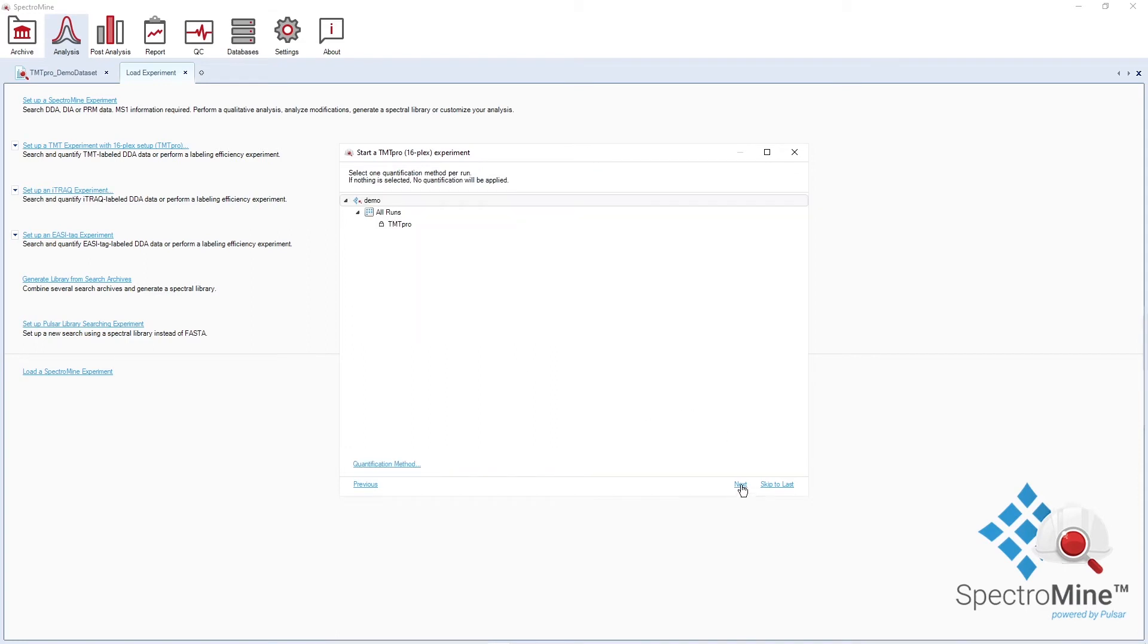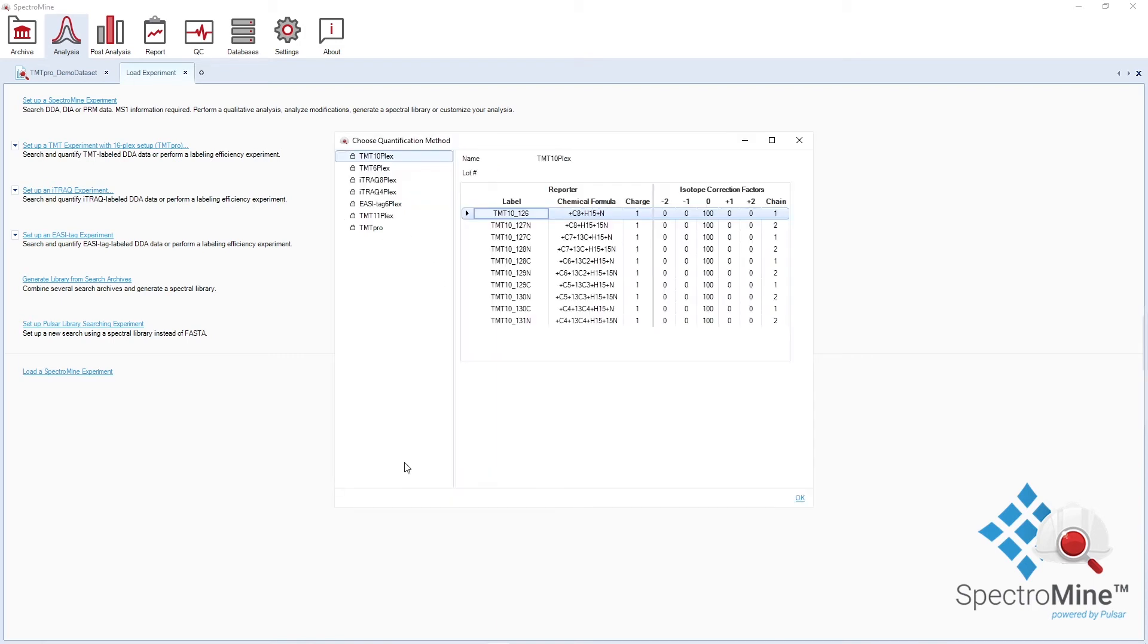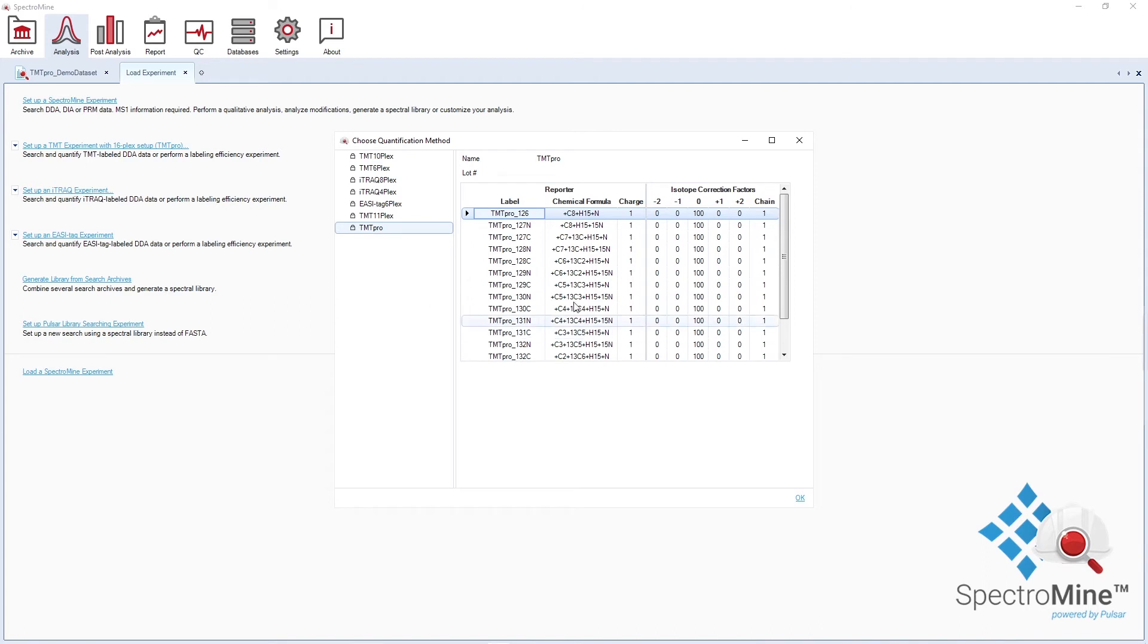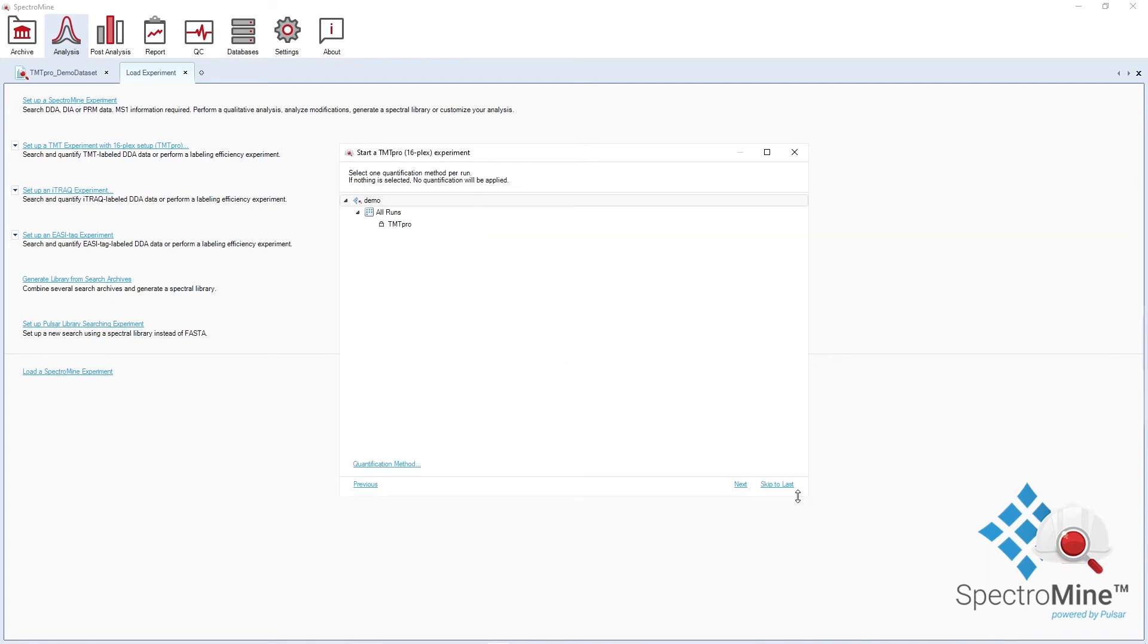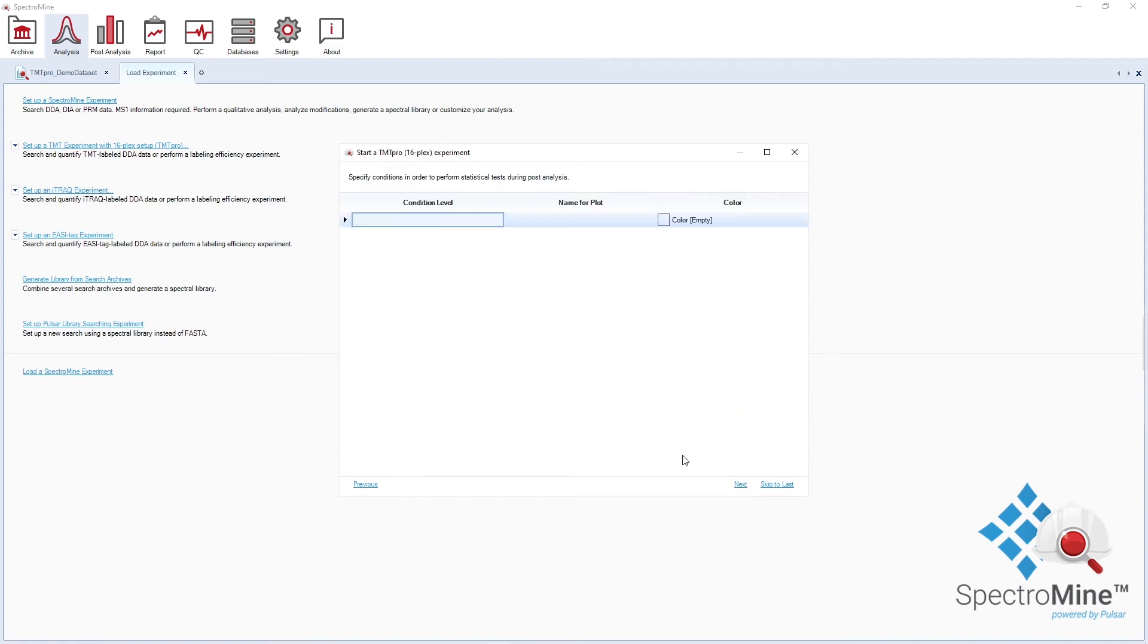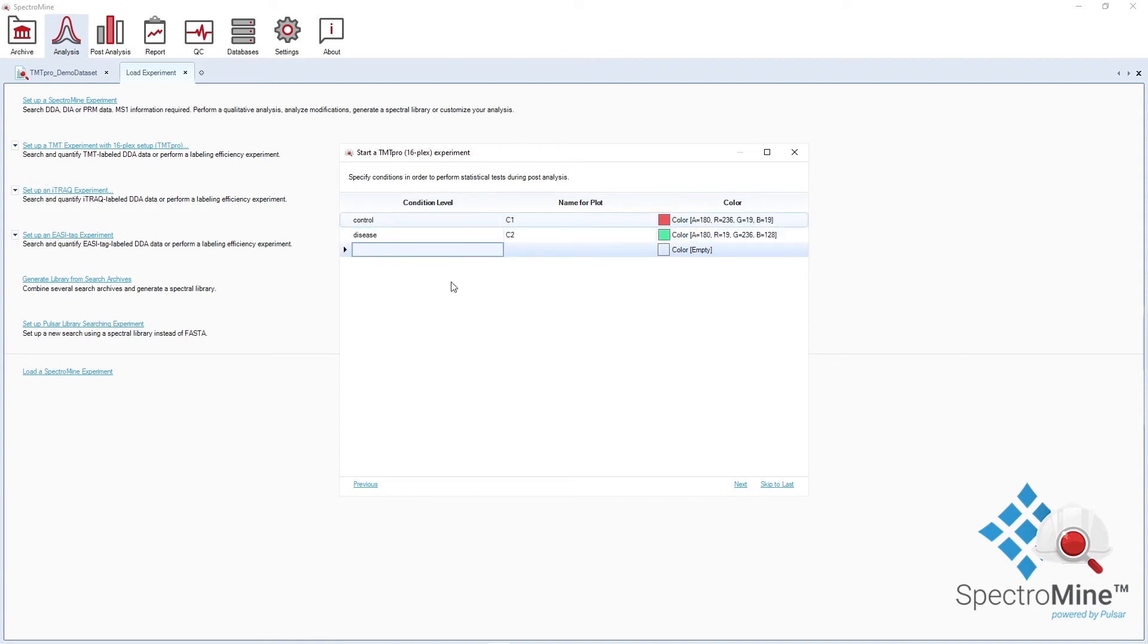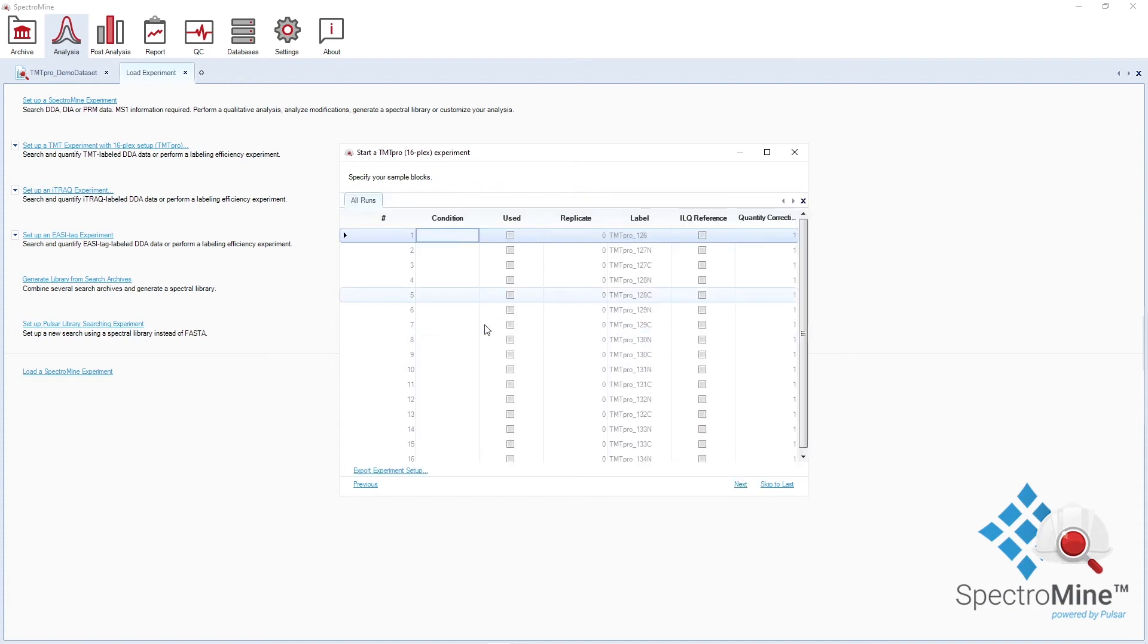The quantification method for TMT Pro is automatically assigned. You can have a look at the quantification method and make sure that the correct TMT labels have been assigned. In the next window, you define the conditions for the differential abundance testing. You can then assign conditions to isobaric tags.